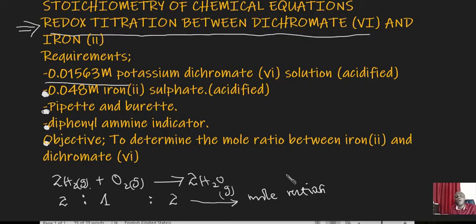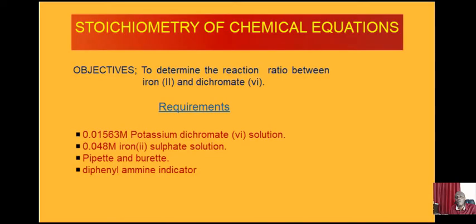The requirements we have are the dichromate solution and also iron(II).